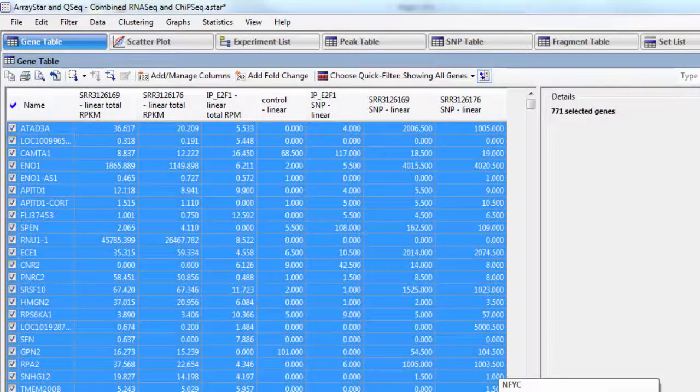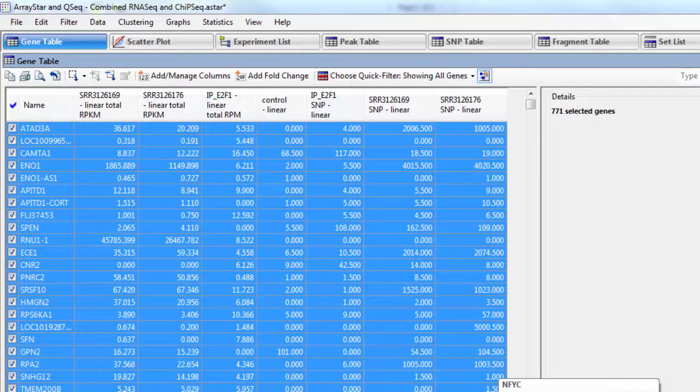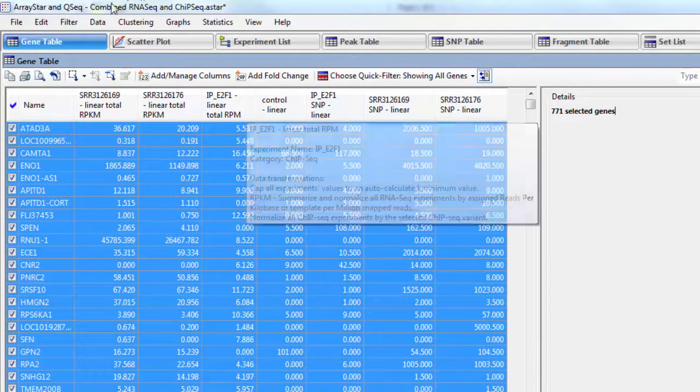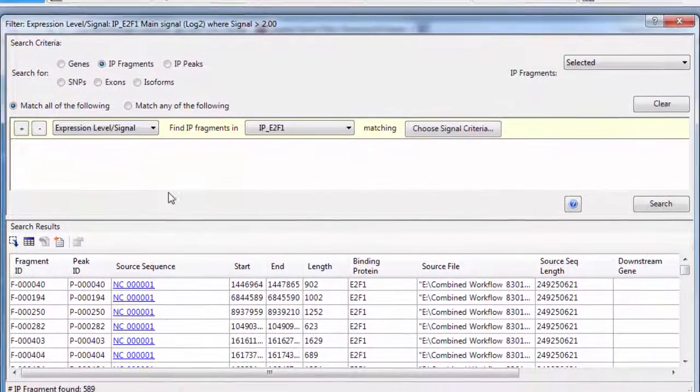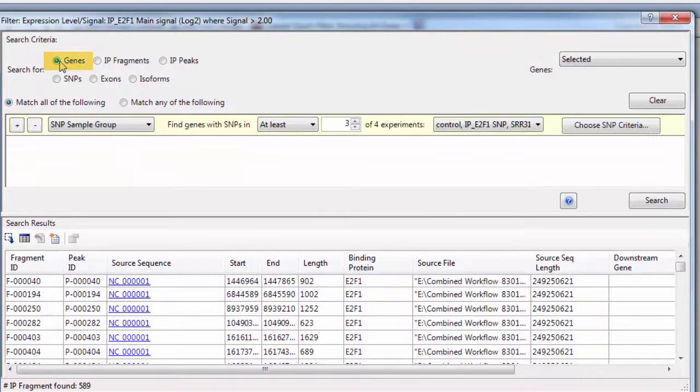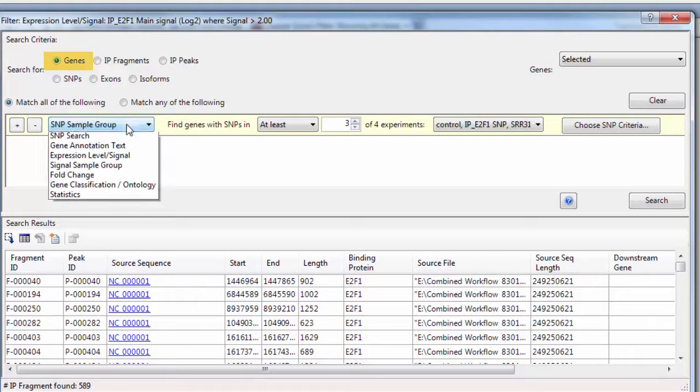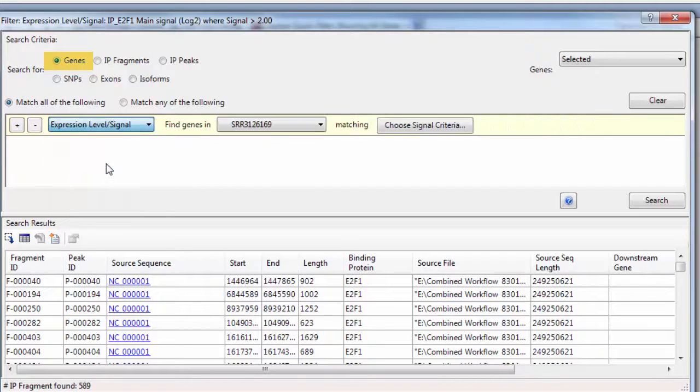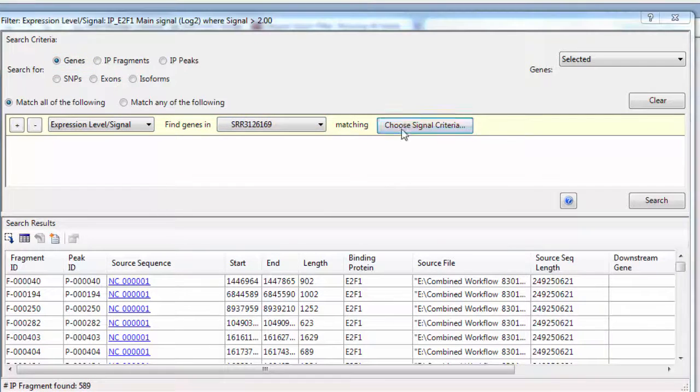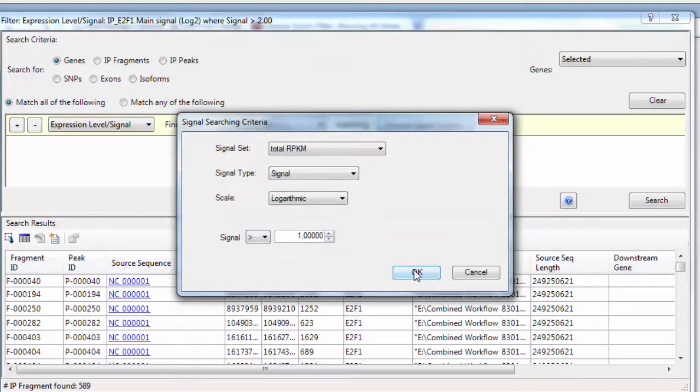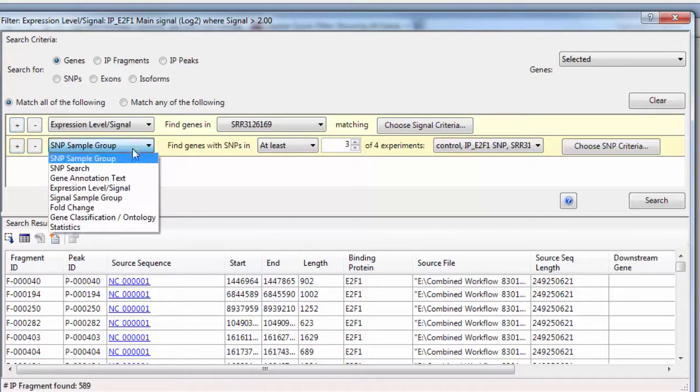So now what I want to do is further filter down these genes to find genes that show an upregulation in gene expression as well. So I'll go to Filter, Filter Selected. And here we want to search for genes of at least log 1 in each of my RNA-seq experiments.